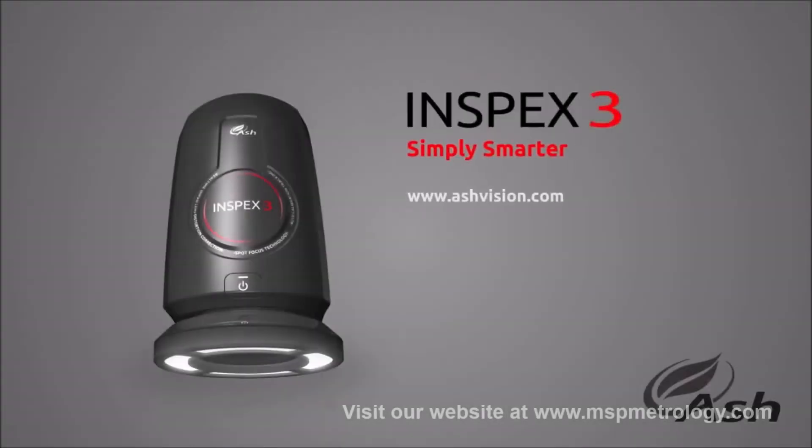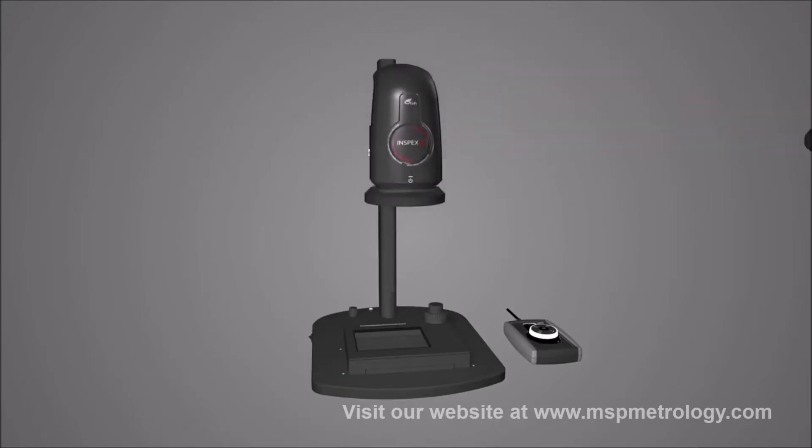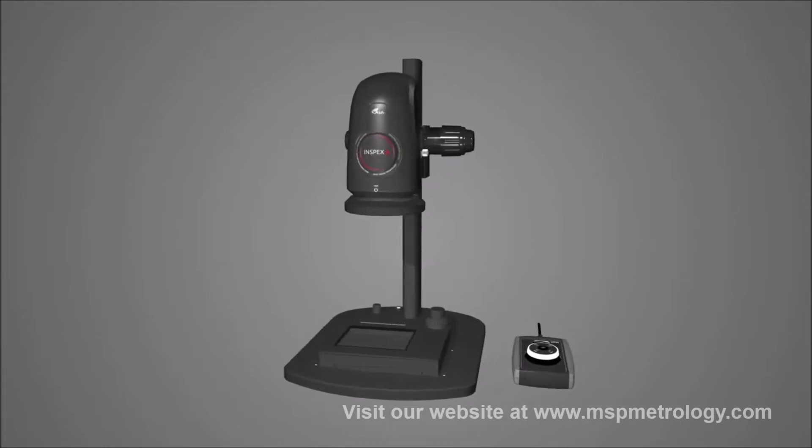Inspex 3 Digital Microscope from ASH. Inspex 3 is a powerful, flexible and intuitive HD digital microscope designed around ASH's new 30x HD camera module.